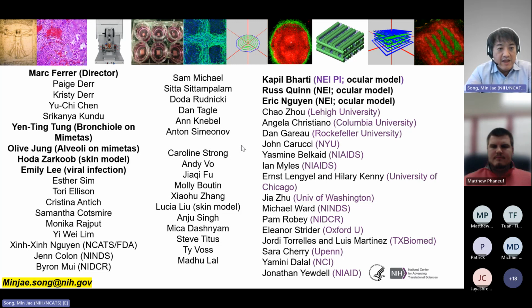But if you have good control of the degradation of this PLGA, and you have fast degradation of the PLGA, then this degraded space is wide open, and the vasculature goes through this degraded space toward the RPE. So this is mimicking the pathological condition of wet AMD.